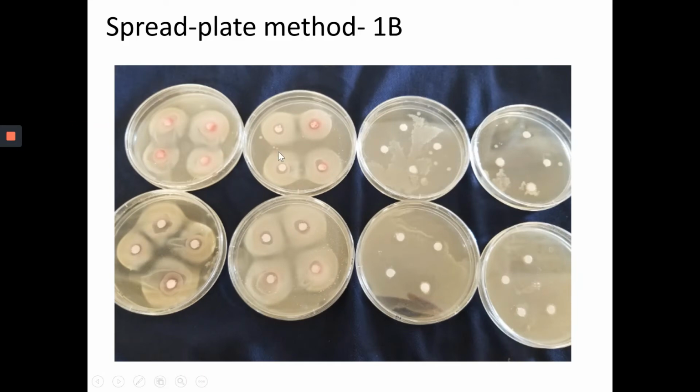For example, we can see the next slide. This one is with the lead nitrate, which is toxic, so antimicrobial. And this part is just a control, which is distilled water. Actually, not all of these distilled water plates work as well. We'll explain in the next slide.